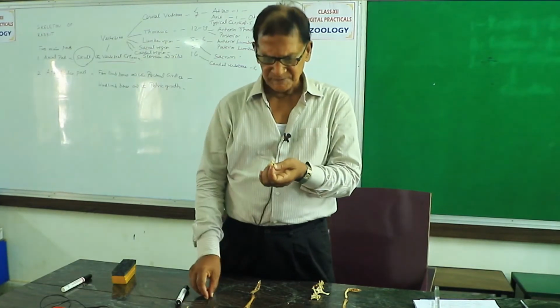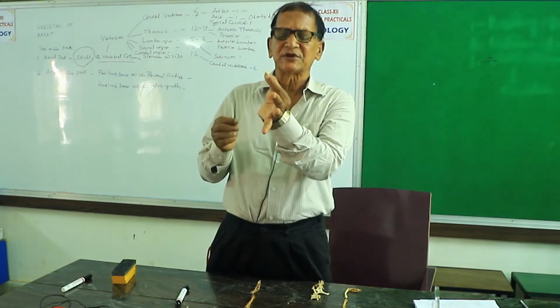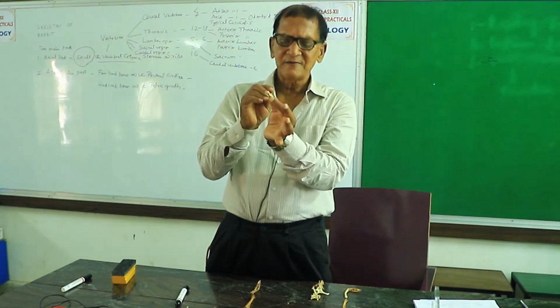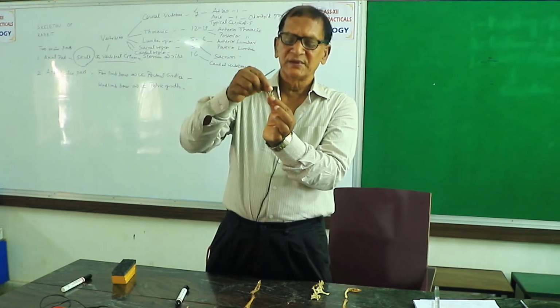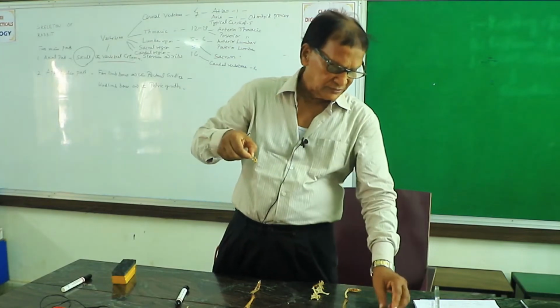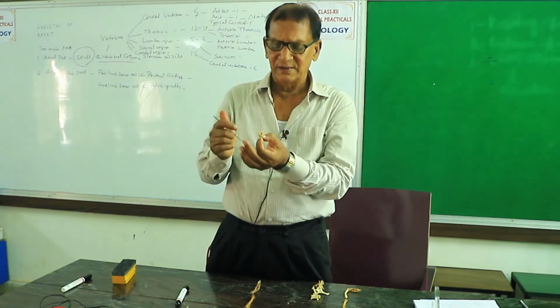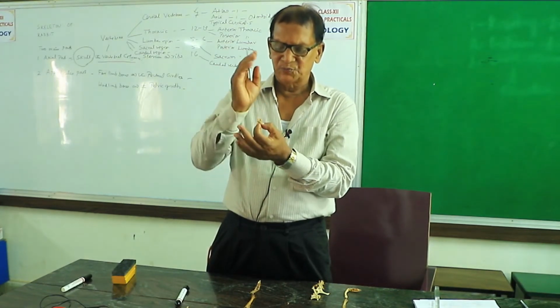Now posterior thoracic, as usual, has an amphiplatian centrum. This is the centrum or base, which is flat on both the sides. So amphiplatian centrum. Then we have the neural canal. Then surrounding the neural canal, we have the neural arch. Then this is the vertically directed neural spine. So this here, you see, it was backwardly directed in the anterior thoracic. Posterior thoracic is easily identified by the vertical direction in which the neural spine is projected.